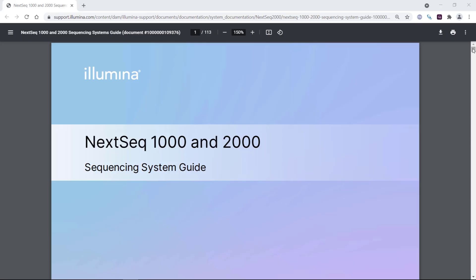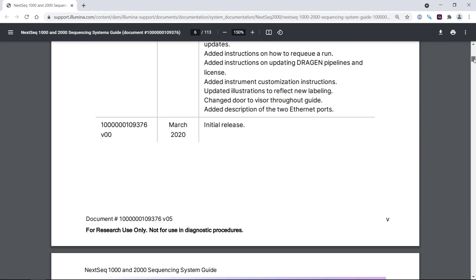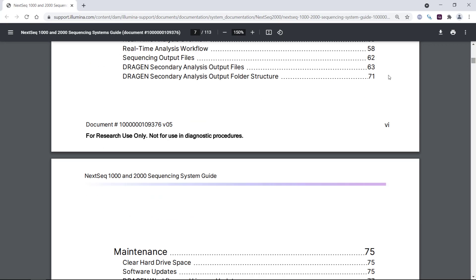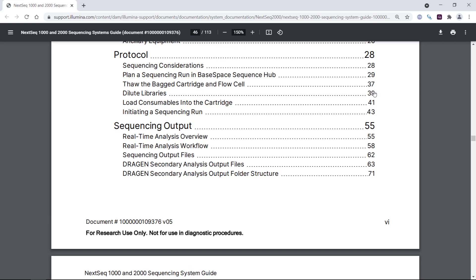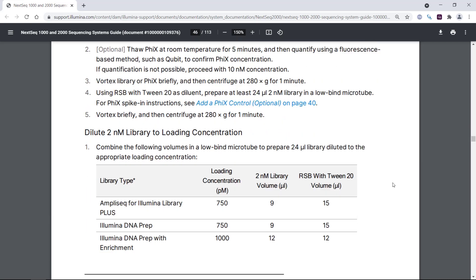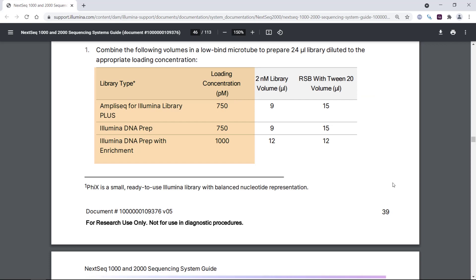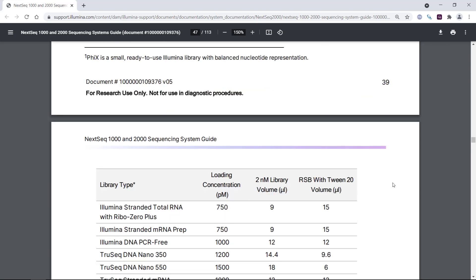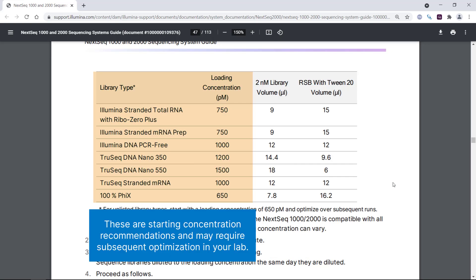Here I'm looking at the NextSeq 1000 and 2000 Sequencing System Guide. I'll navigate to the Dilute Libraries section. We see a table with recommended final concentrations for different Illumina library types. Again, keep in mind that these are starting concentration recommendations and may require subsequent optimization in your lab.